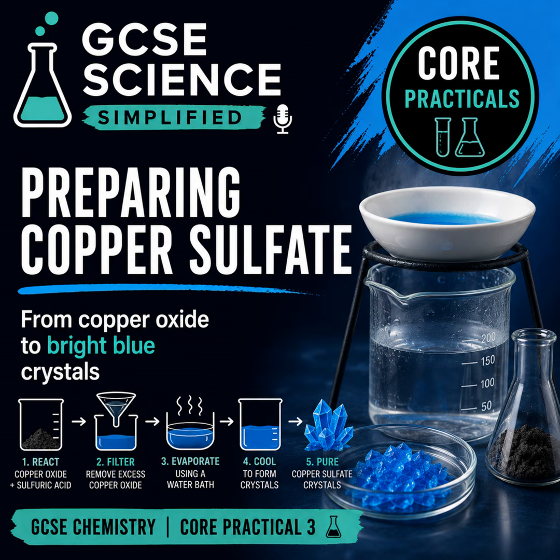So, what do we actually do? We don't just mix and hope. Every step has a purpose. Step 1. We warm the acid. We need to gently heat the sulfuric acid to keep it safe, but more importantly, to increase the rate of reaction. If we warm it, particles move faster, there are more successful collisions, and that means a faster reaction.